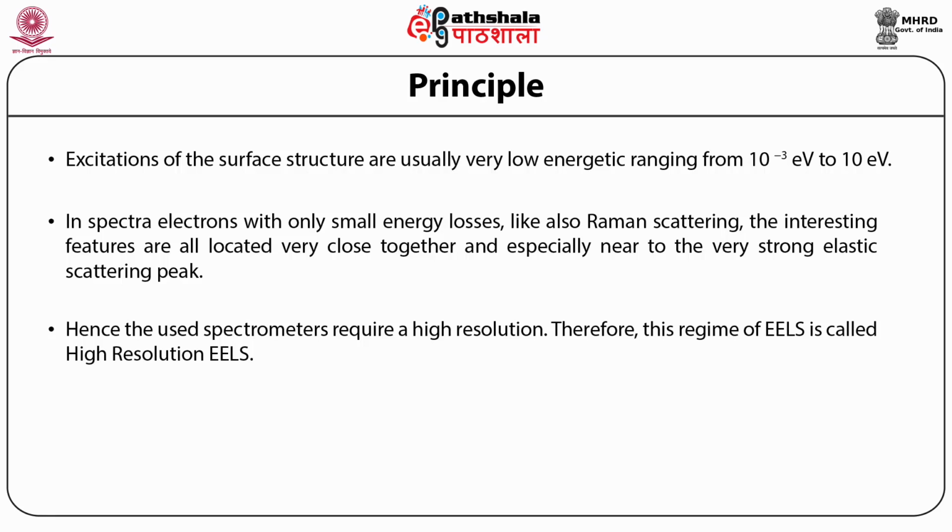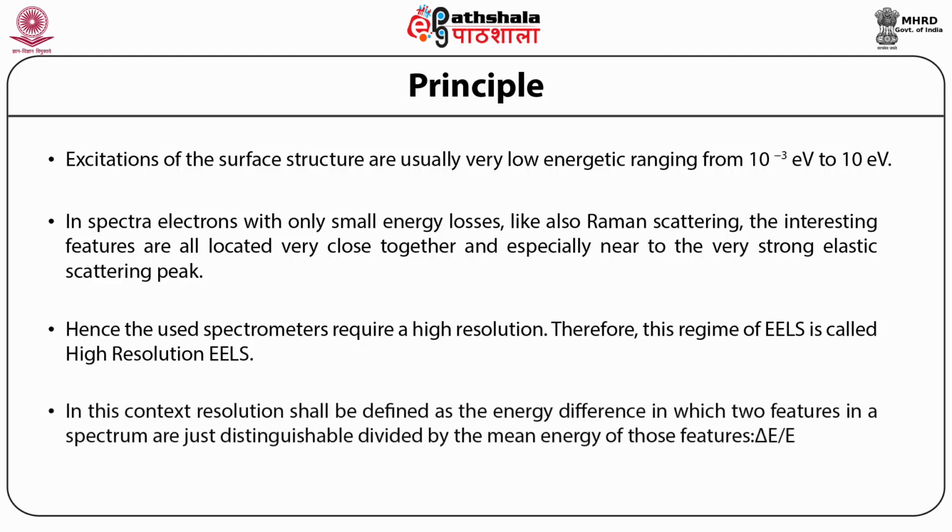Therefore, this regime of EELS is called high resolution electron energy loss spectroscopy. In this context, resolution shall be defined as the energy difference in which two features in a spectrum are just distinguishable, divided by the mean energy of those features. That is, this could be the change in energy divided by the total energy. This would give you the measurement parameter.